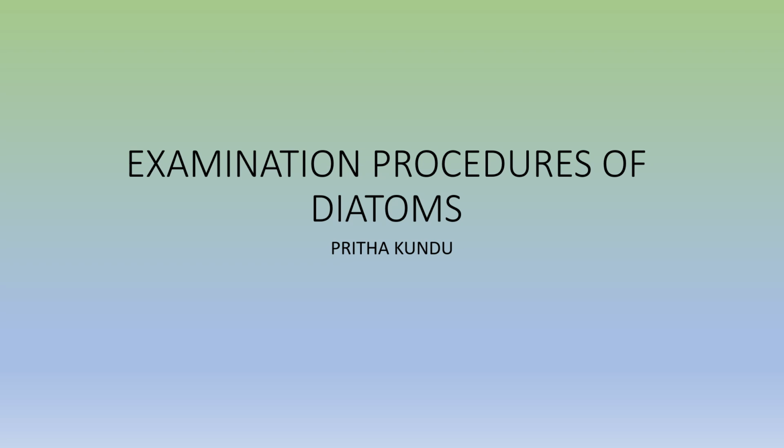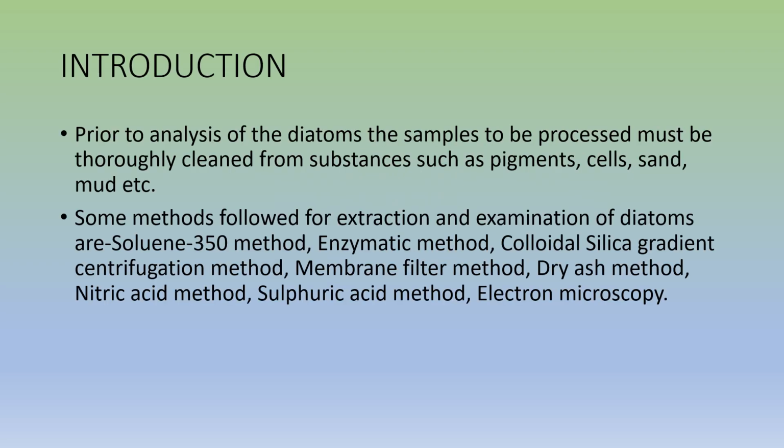Today we are going to discuss the examination procedures of diatoms. Introduction. As we have already learned in our previous video, diatoms are found in water bodies. So in cases of drowning, there is a chance of getting these diatoms.